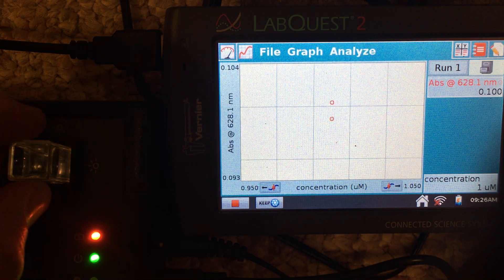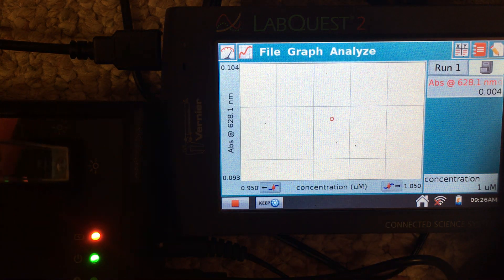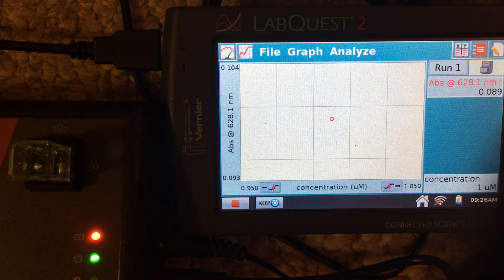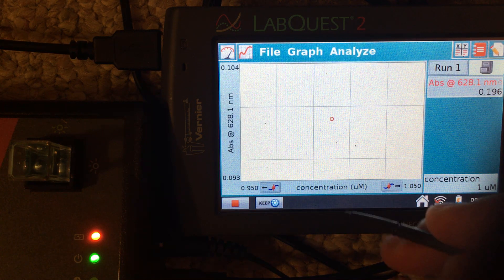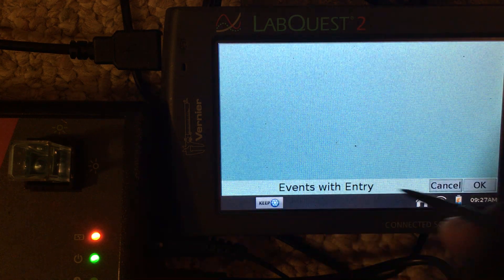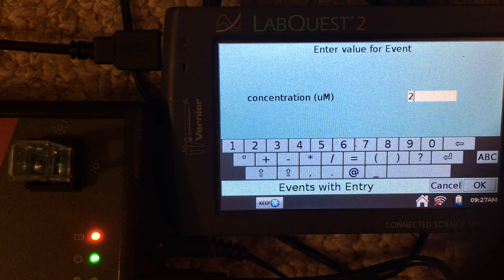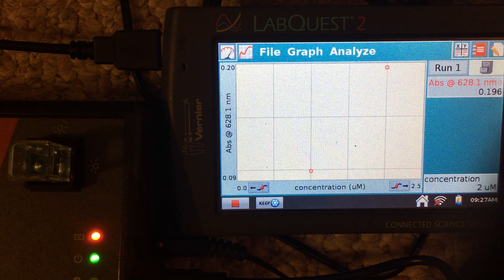We remove the first cuvette and replace it with a different standard. You'll notice this solution has a different concentration and a different absorbance at that wavelength. Again, we tap keep and enter the new concentration — 2 micromolar in this case — and hit OK.